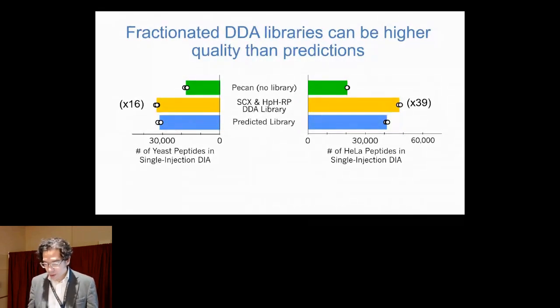To combat this, we've tried to develop other ways of extracting this type of information. One of our approaches has been to segment our DIA-based acquisition into two different frameworks. One is to acquire quantitative data, and the other is to acquire data specifically designed around detecting peptides, rather than quantifying and detecting peptides in the same runs.